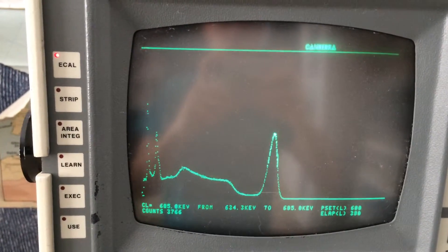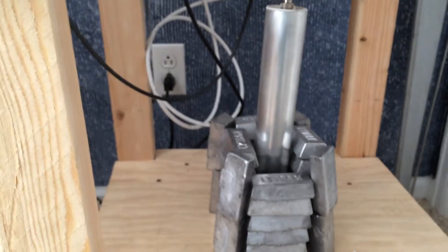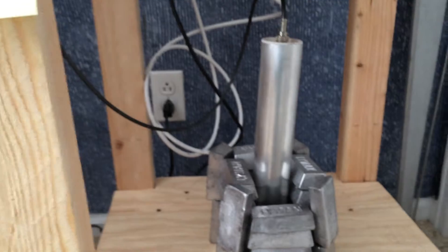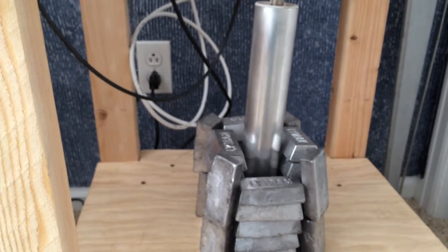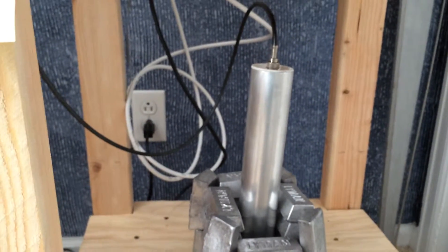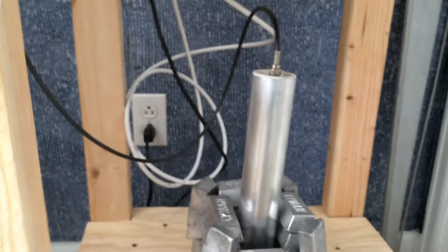Hey guys, just a quickie. I was sort of curious what the resolution of my detector was. This was a homemade detector that I made with a 1.5 inch by 3 inch sodium iodide thallium-doped crystal and an 8-stage photomultiplier tube. The tube isn't as good as it could be — it could be like 10-stage or something — but I was wondering what the resolution was.